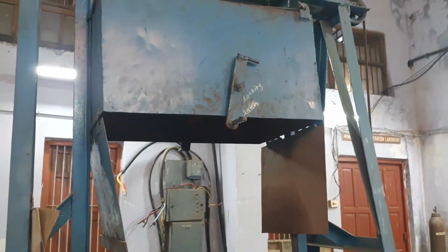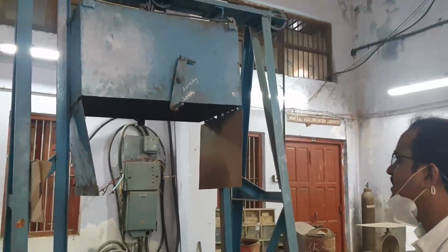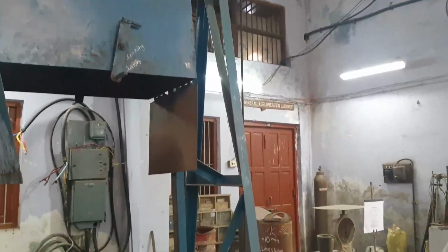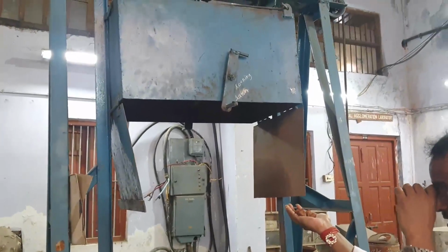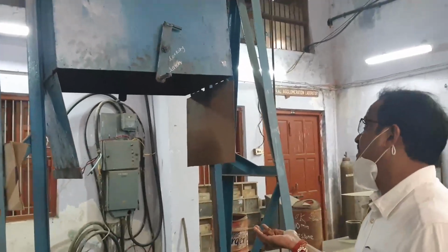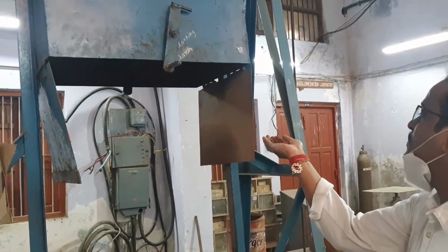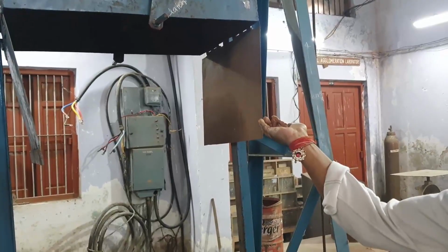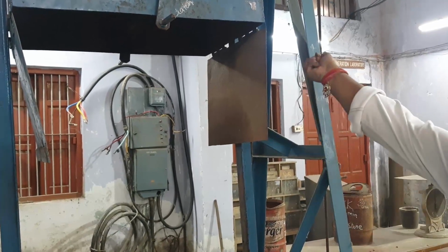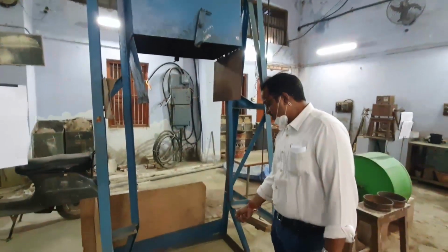Setup of the shatter index. Shatter means falling and breaking into pieces. Here we are taking the iron ore and checking the shatter index. Shatter index is the resistance of the material to becoming fragments. We will drop this material from a certain height, from 2 meter height, and the material will fall on a steel plate.